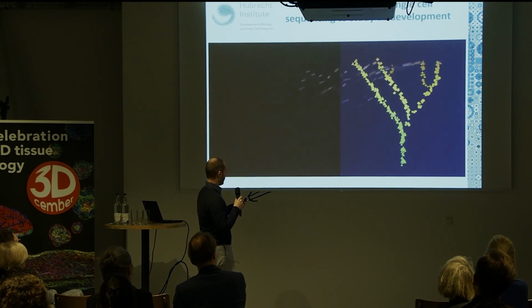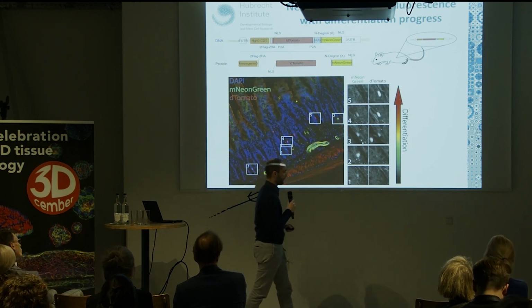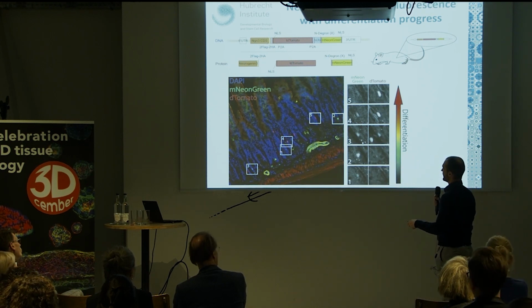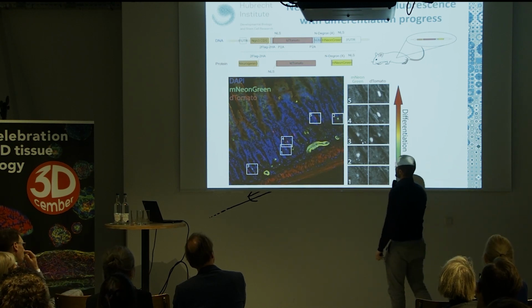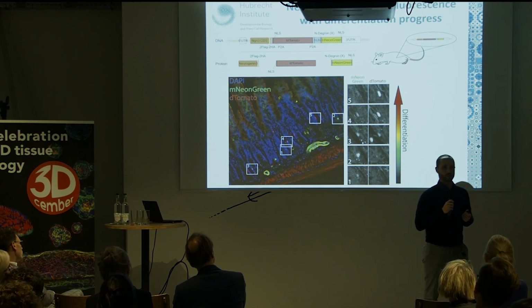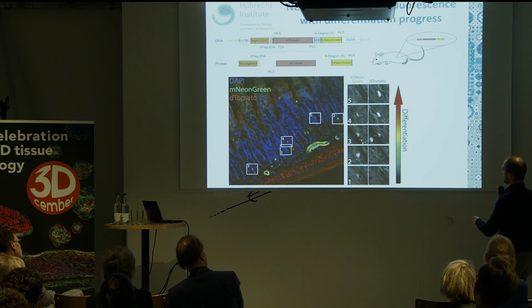So in reality, that looks like this. This would be just the intestine of this neurogenin 3 chrono mouse. And you can see we have here enteroendocrine cells in all these different stages of differentiation, starting green, strong green, green and red, and finally just red. What we don't have, really, is a good correlation between this fluorescence and actual time, because we have no idea how much time has passed since the cell went from this stage to this stage, for example.